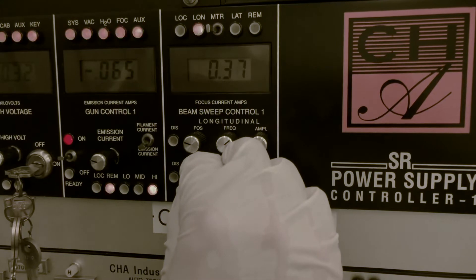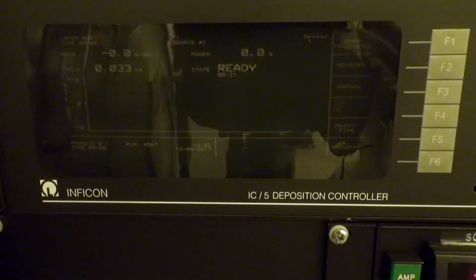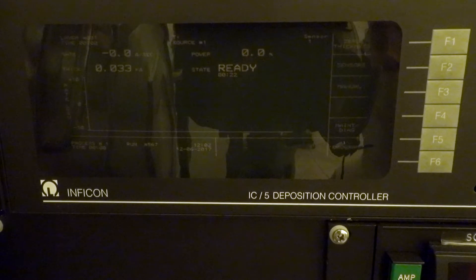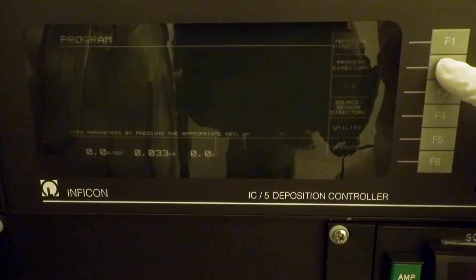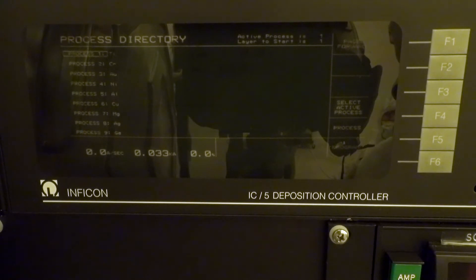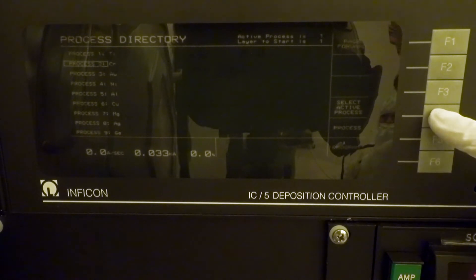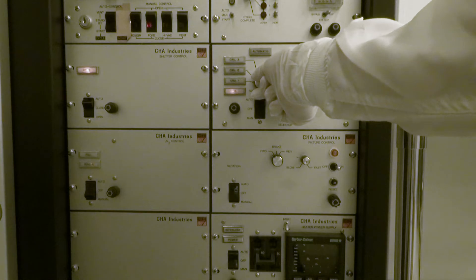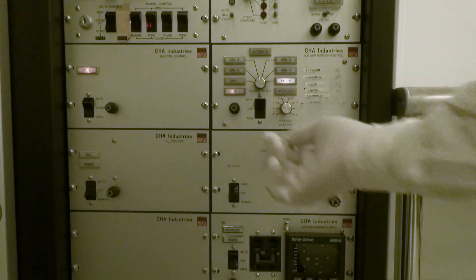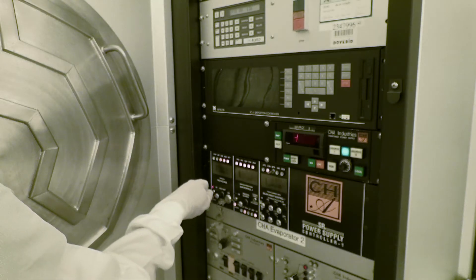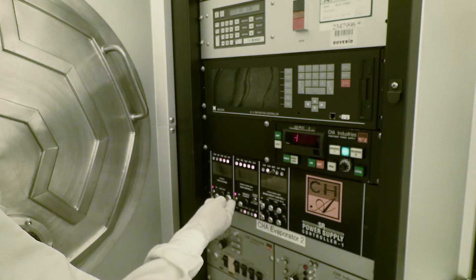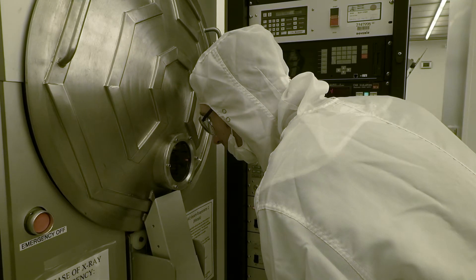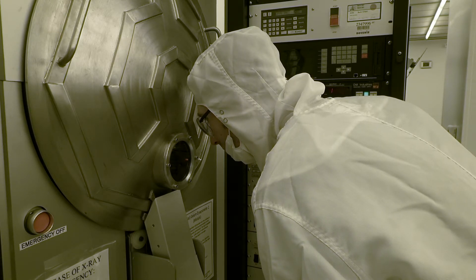When the process is complete, you can either deposit another metal or begin unloading. If you plan to deposit another metal, wait about 3 minutes for the crucible to cool down. You can change metals by pressing F6 for program, then F2 for process directory on the deposition controller. Highlight the metal you want to evaporate next and press F4 for select active, then press F6 for operate. Once your process has been selected, manually switch the crucible using the gun rotation control knob. For every material, the high voltage and gun control switches must be turned on again. Then press start on the deposition controller and align the beam as you did with the previous metal.